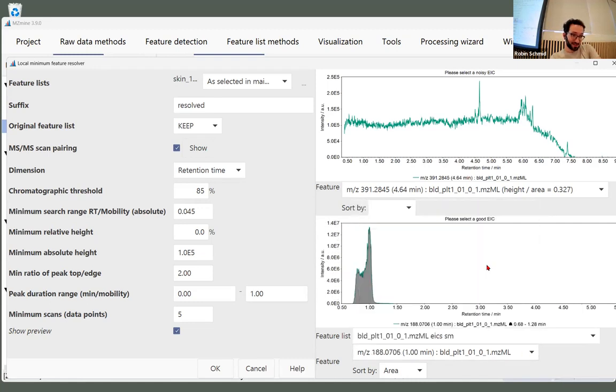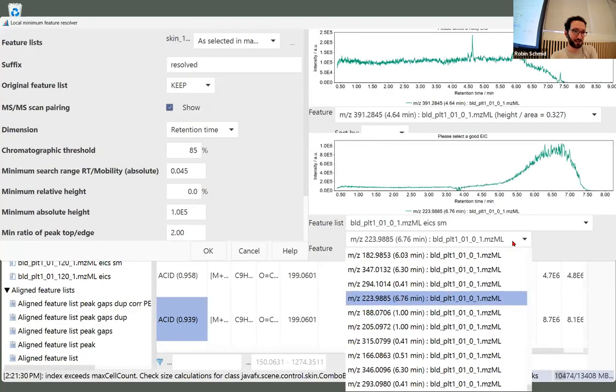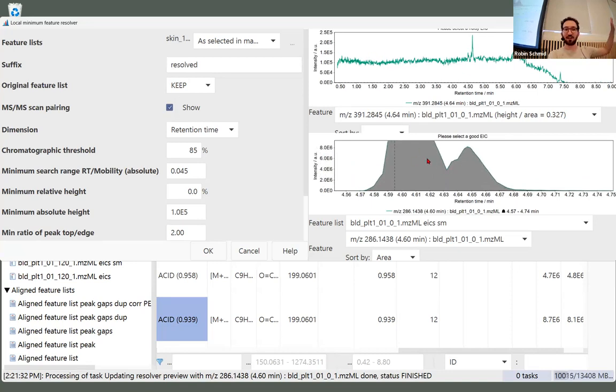Let me see. I just have to try out some, so we can also click on this. If the screen is larger, it's also a bit easier because then we can just drop it down and go through with arrows. And here we have a perfect example. It's a very intense peak, right? So it's maybe not the most representative, but at least we got something that is not very baseline separated. So we want to find something on the top and on the bottom.